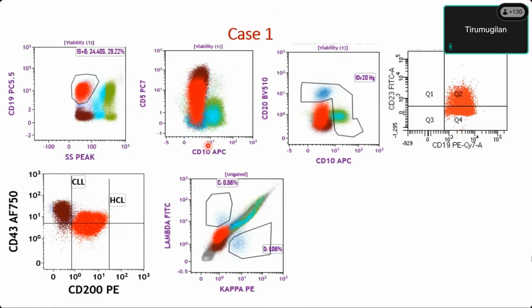Variable. Okay, positive. CD10 expression. CD10 is negative, sir. Okay. And CD20. CD20 is also dim positive, sir.